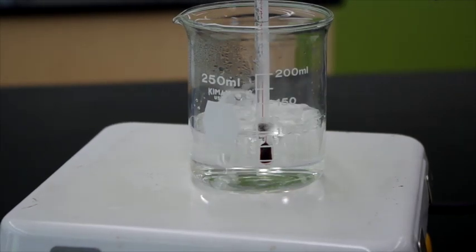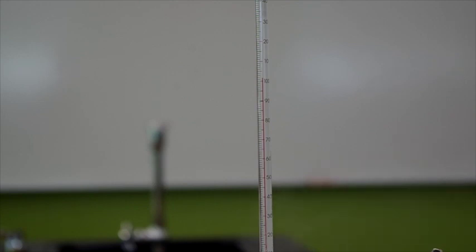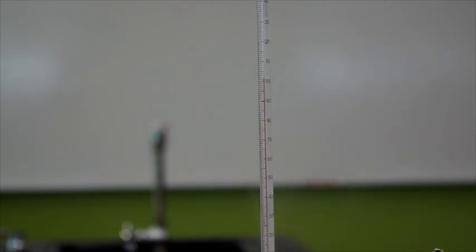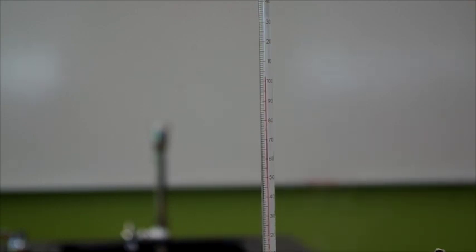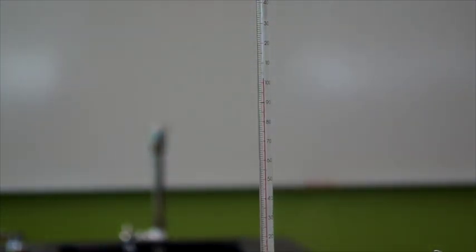Now we're going to keep it boiling for 4 minutes or so. Technically reading 103 degrees.